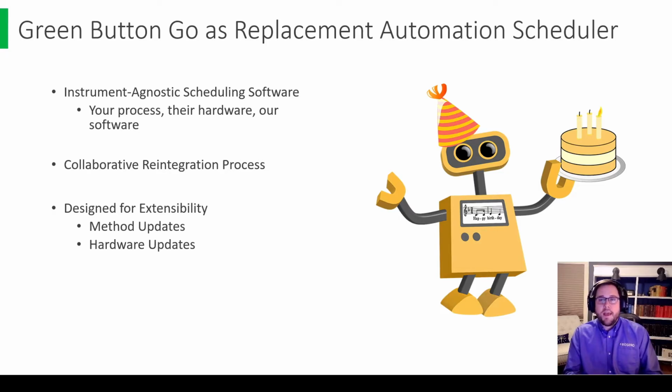So whether or not you want to add another stacker or another sealer or another plate washer, or whether or not you just want to have it send you a text message every time that a run's done. All of those things we want to make sure we collect as part of the package that we're going to be delivering to you eventually.